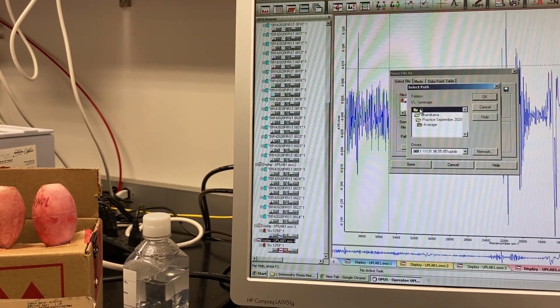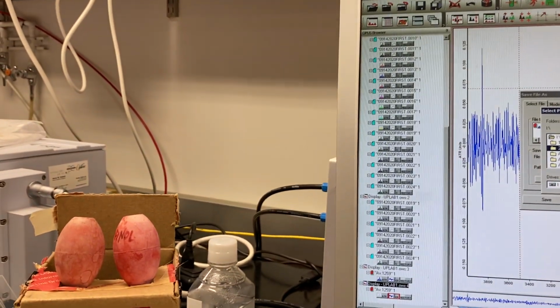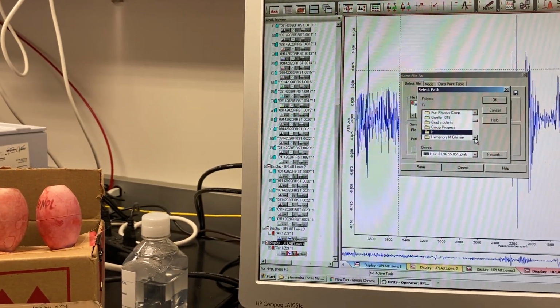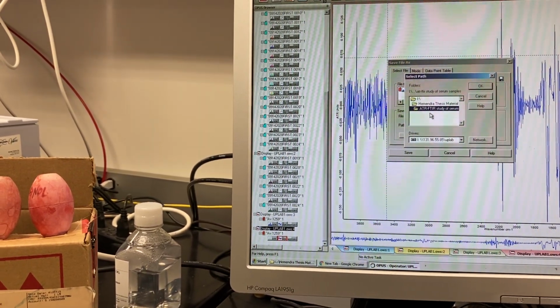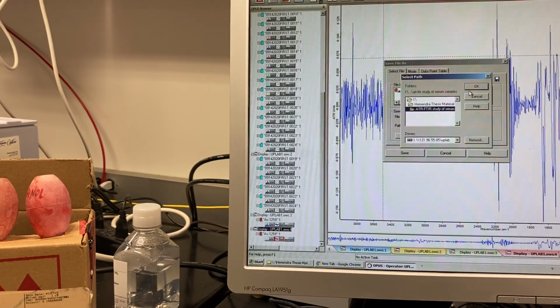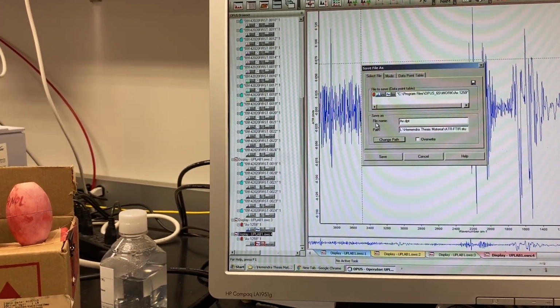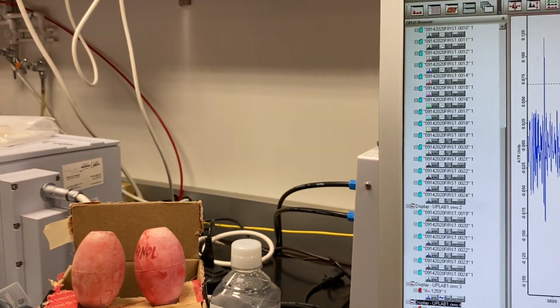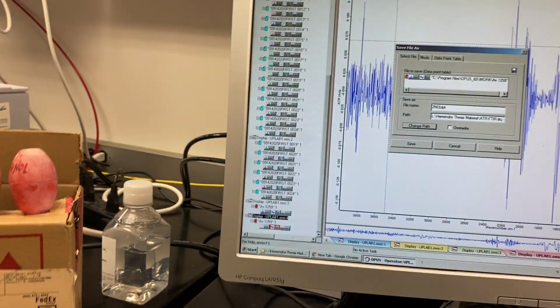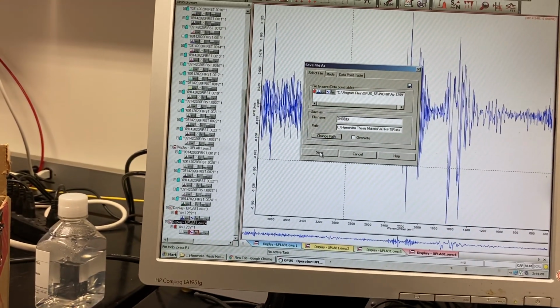So let's go to L drive, go to my folder, this is the thesis material ATR FTIR. Just save here. Later on you can save in a different folder. Give a different name, 2ND. This is the second derivative, so I saved only the vector normalized one, and then save.